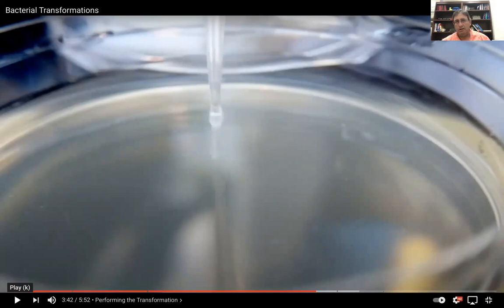Just as a note, the centrifugation is especially helpful if you have low competency cells or very small amounts of DNA, so your efficiency is really low. For your average plasmid transformation, that isn't necessary and can be skipped, and that's not involved in the protocol that you can find on the website.